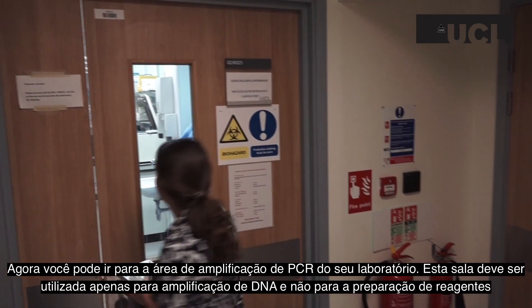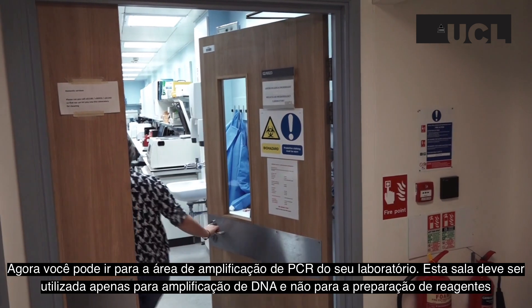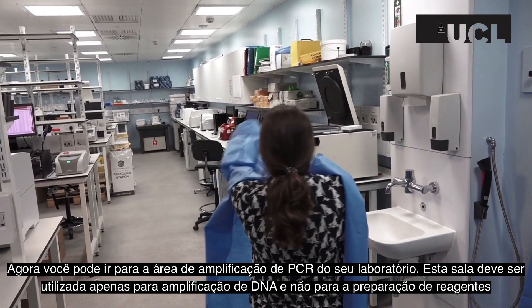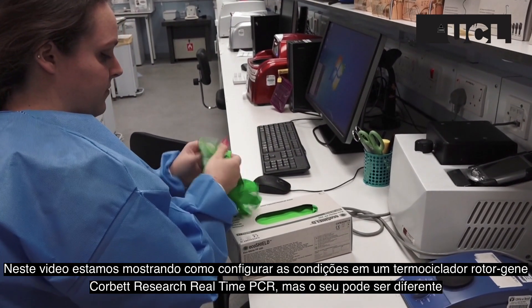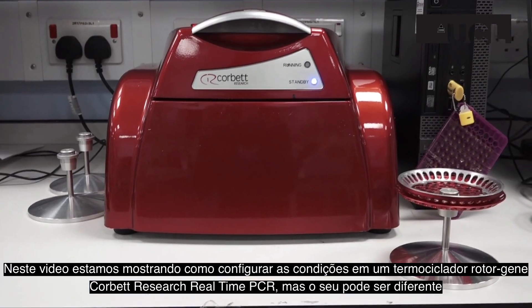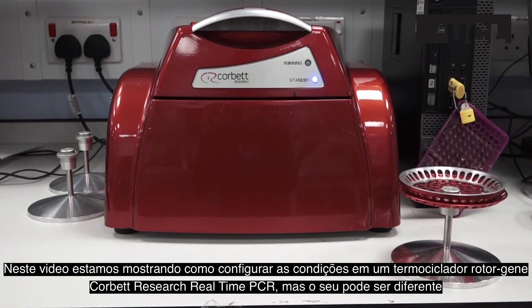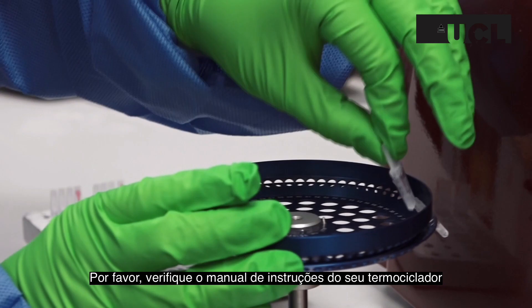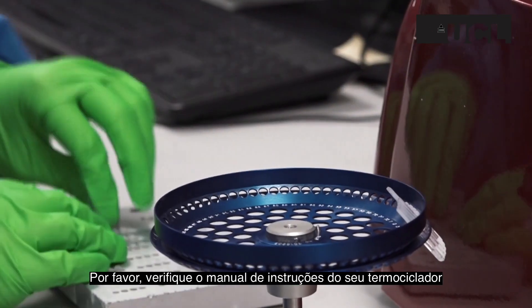You can now proceed to your PCR amplification laboratory. This area should only be used for amplifying DNA and not preparing PCR reagents. In this video, we are showing you how to set up the conditions for a Corbett Research real-time PCR thermocycler rotor gene, but yours may be different. Please refer to the manufacturer's guidelines for how to set up your thermocycler.